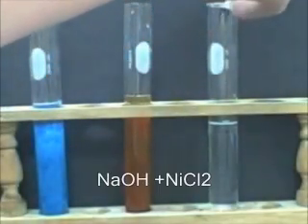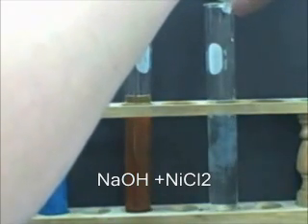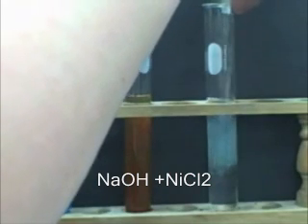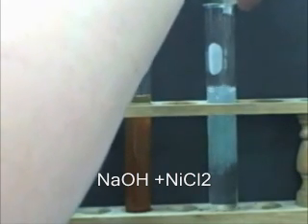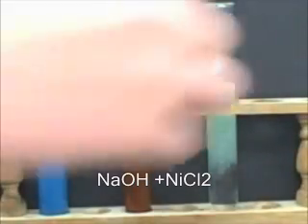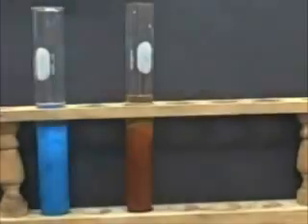In the last vial of sodium hydroxide we add nickel chloride, and we have the precipitation of the nickel hydroxide. The nickel hydroxide is a lightish green color. So this is our copper hydroxide, our iron hydroxide, and our nickel hydroxide precipitates forming.